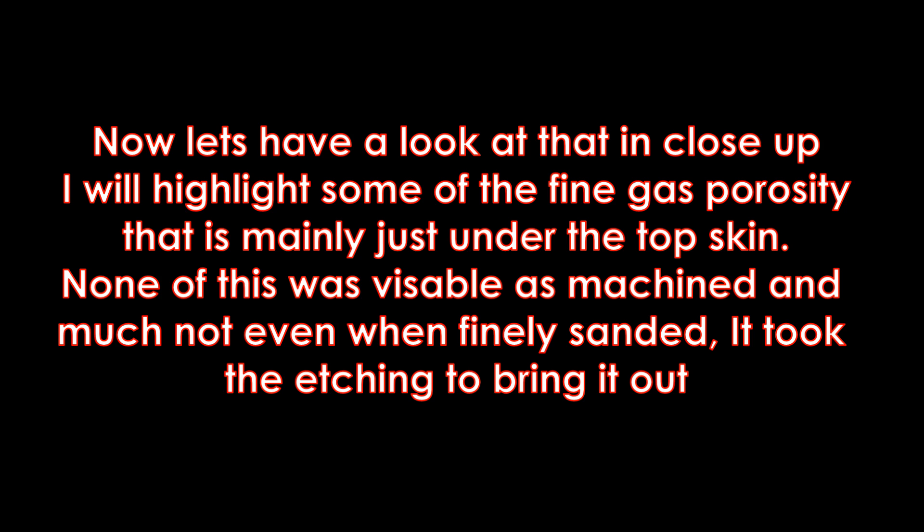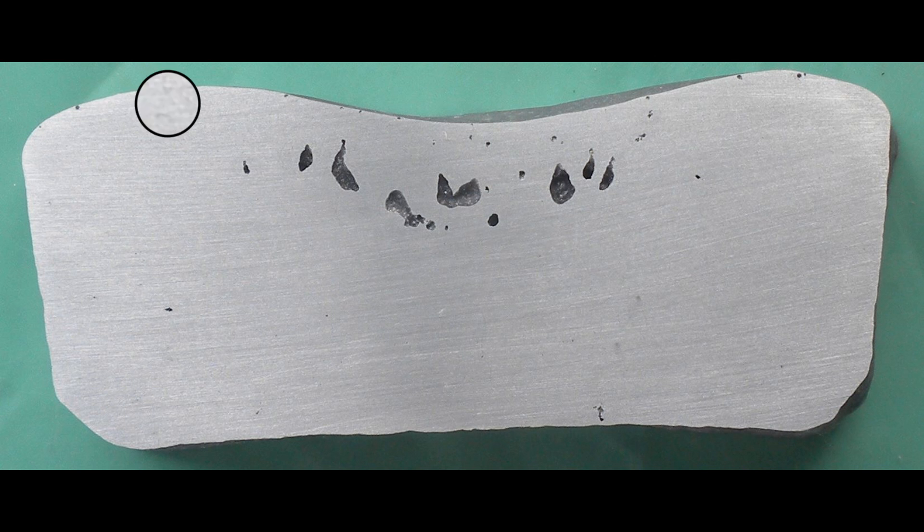Now let's have a look at that in close-up. I will highlight some of the fine gas porosity that is mainly just under the top skin. None of this was visible as machined and much not even when finally sanded. It took the etching to bring it out. Here we go moving from fine bit of porosity to fine bit of porosity. These are very small holes. They would be around the six thousandths of an inch .15 millimetre size. Typical of gas porosity in a casting like this.